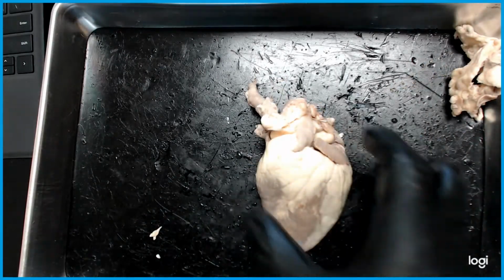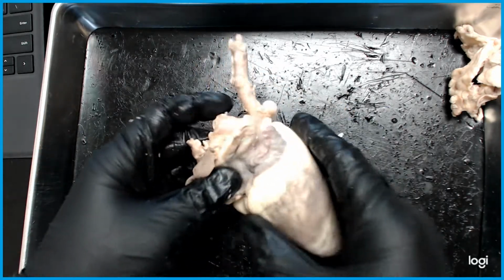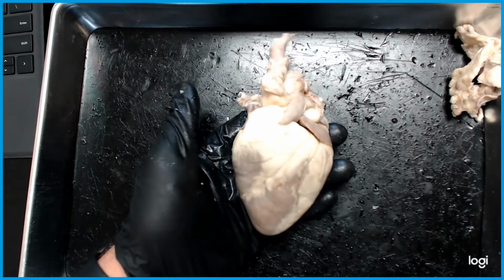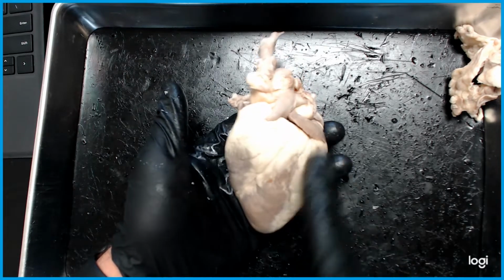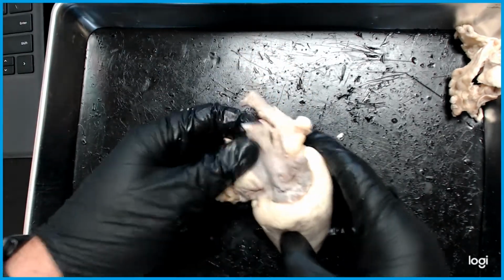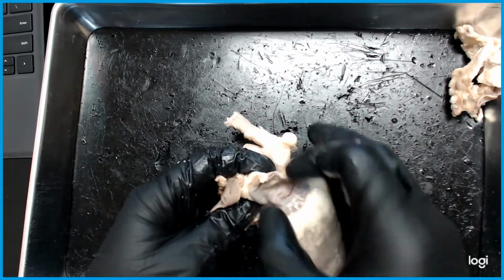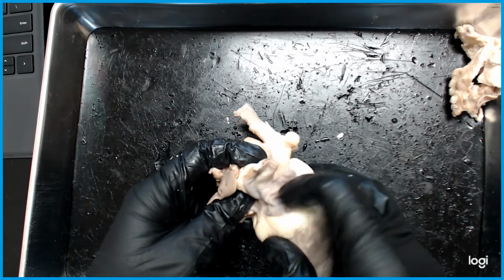Okay, so now we're going to talk about the right atrium and the right ventricle. So we're still looking at the anterior portion. This is the right side, this is the left side. What we have here is your vena cava. So this is going to be your vena cava. This is your atrium, this is your right atrium.